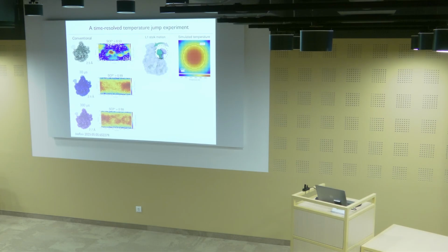So to figure out if this is the case, we sort our particles by temperature. And what I'm plotting here is the amplitude of this motion as a function of the temperature. You see that at 30 microseconds, we barely have any temperature dependence. Actually, it looks to be kind of negative, which probably is an artifact of how we extract the amplitude of this motion. So what seems to happen is that at 30 microseconds, this is the amplitude of motion that corresponds to the temperature at which we've prepared the sample, right? The amplitude didn't have enough time to change, and then we see that at 150 microseconds, in the colder parts of the sample, the amplitude of motion narrows, and then at 300 microseconds, we get a pronounced temperature dependence.